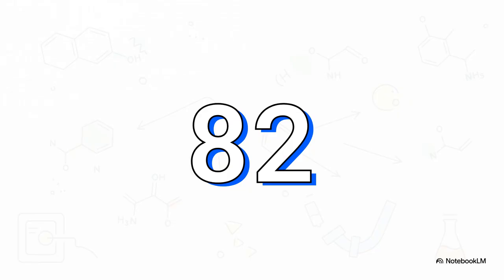This represents the bicyclic radical cation that forms the exact second cyclohexanol loses that water molecule. So, if you're analyzing your data, and you see a missing molecular ion but a really strong M-18 peak, landing you at exactly 82, you've got a highly identifiable signature. It's a dead giveaway that an alcohol is hiding in your sample.